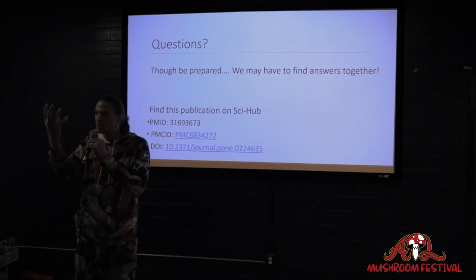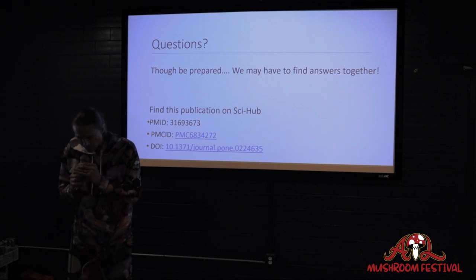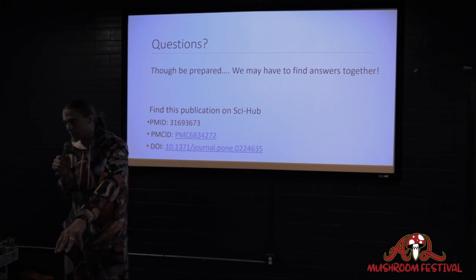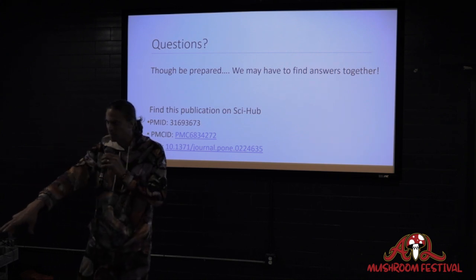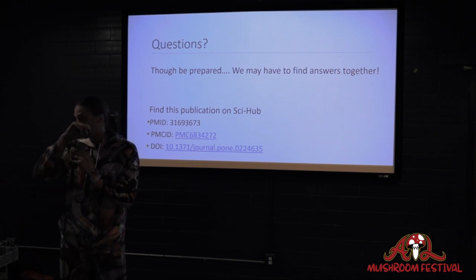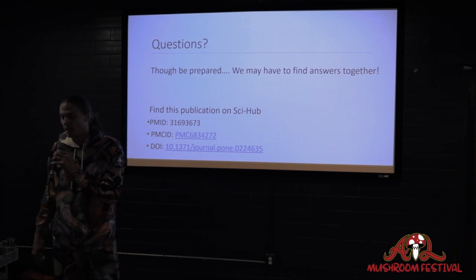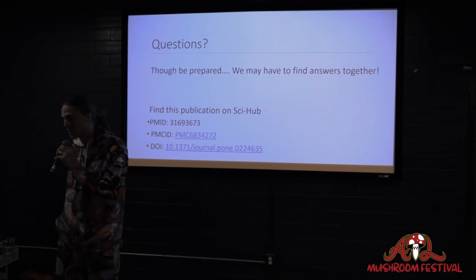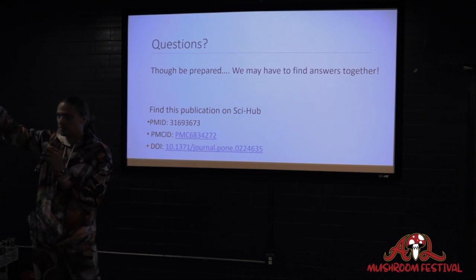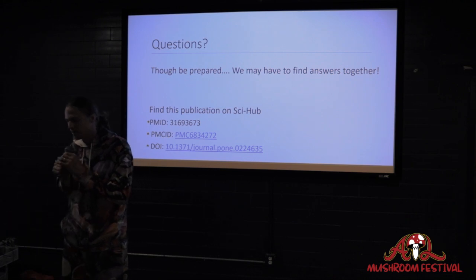And as it's peeking through that agar, you can look at it and say, okay, there's a very high likelihood that this is probably a contamination, a fungal contamination. This one is probably my culture of interest. And anytime I notice that there's a contamination on my plate, I always do it again. I always re-transfer. But I've never had to do it more than twice. I've done it more than twice, but not seeing any more effectiveness in the results. It tends to be pretty much the same.